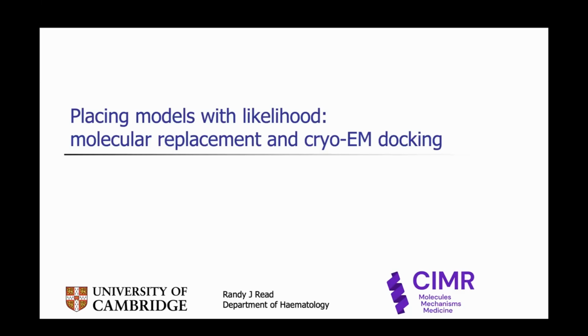Okay, so I'm going to talk about how we take these models and place them in our experimental data, which is either molecular replacement for crystallography or docking for cryo-EM. And our whole focus since about the time Phoenix started is using likelihood as a tool. So I'll tell you a little bit about likelihood and why we like that and how we use it for these processes.